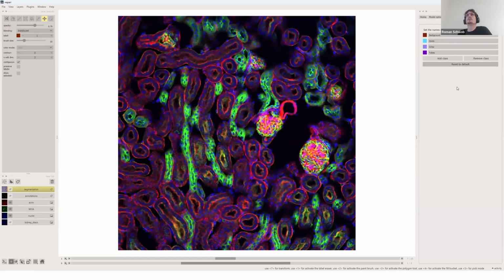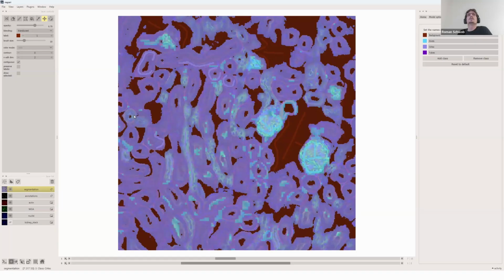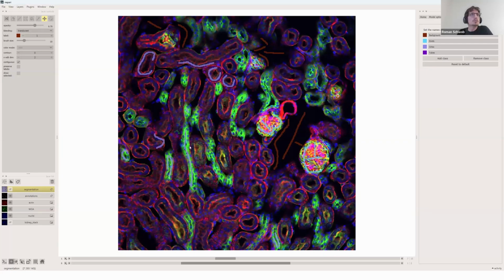Let me see. I'm a bit confused right now. Give me a second, please.